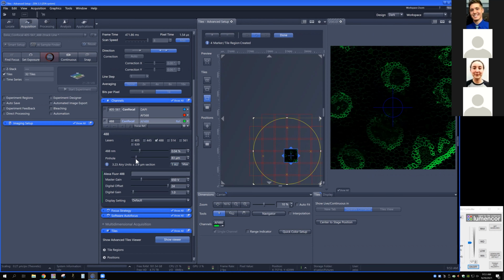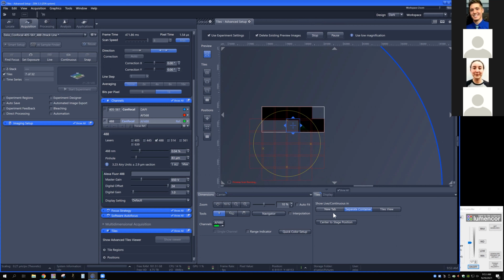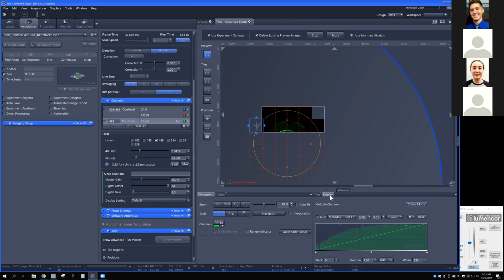So I'm going to open up my pinhole a little bit here so I get a bit more signal and my focus is a little thicker. And again, with this new region, I can basically go to my preview scan and let's just create that again. Oops, went a little bit overkill, I guess. You can see the contour points of the X's right here. And I did go a little bit too much, but hopefully you get the idea.